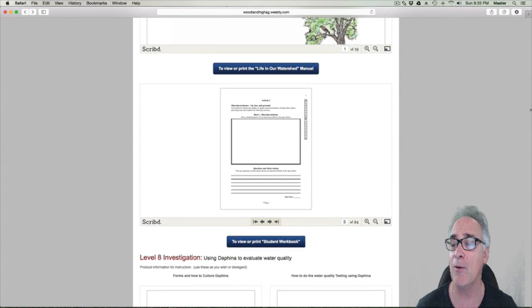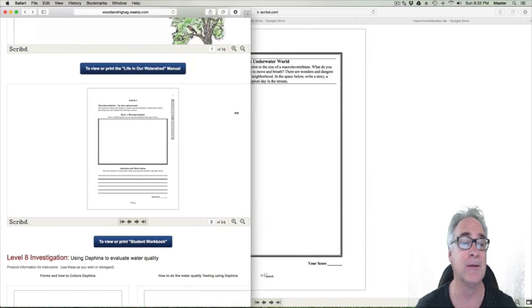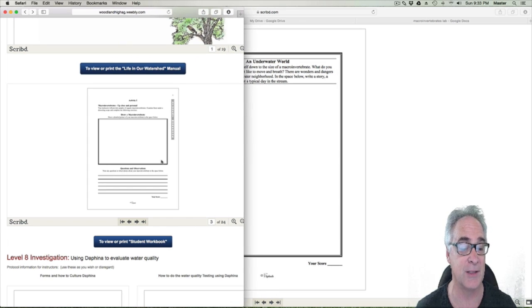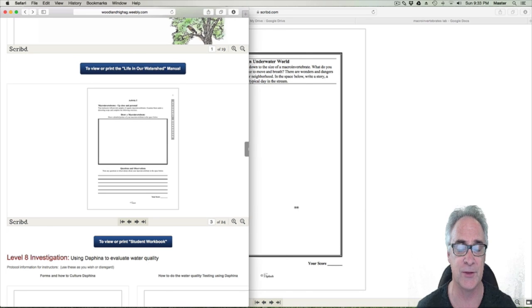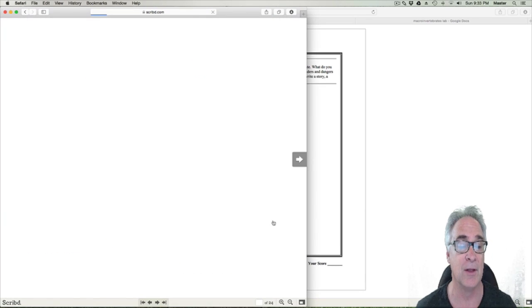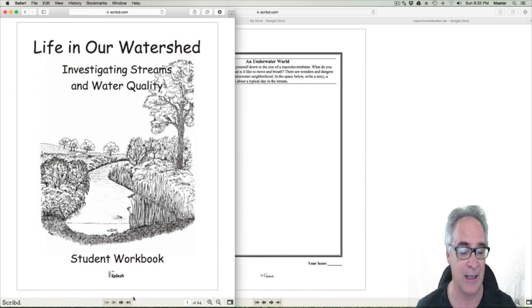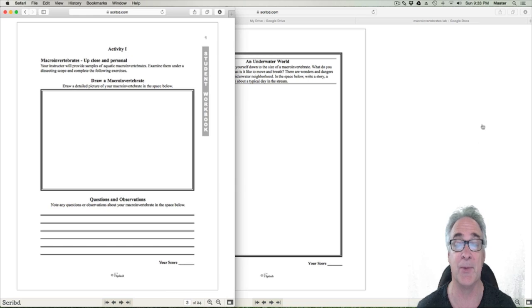You're going to let it go. And now what we're going to do is squeeze it down to about, let's say, there. So you can take a look at this. Let me do this first. Let me, first of all, make it a full page. That'll be better so you can see it much easier. And then you're going to go to the page I want.